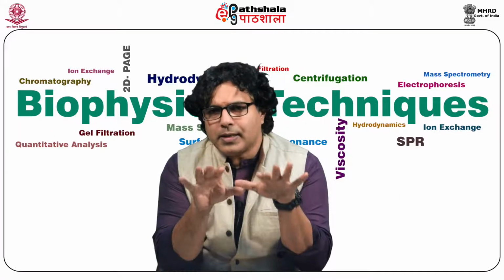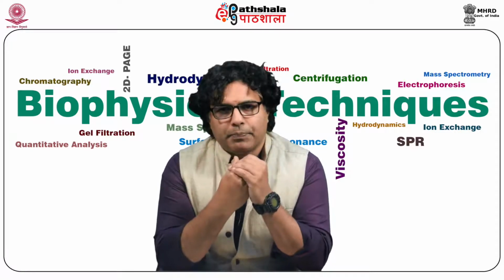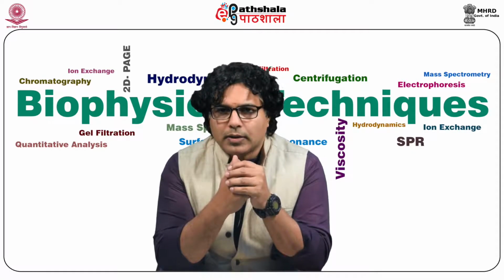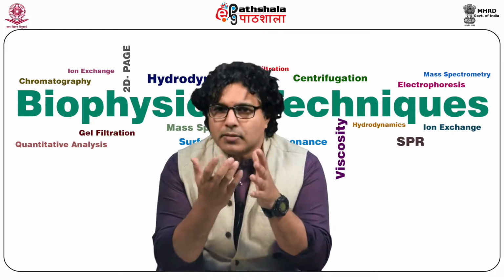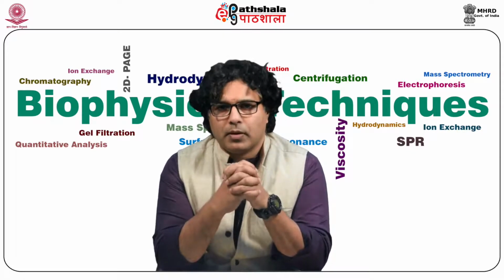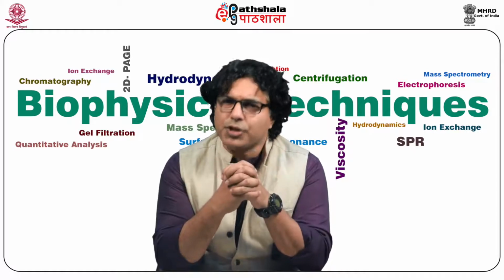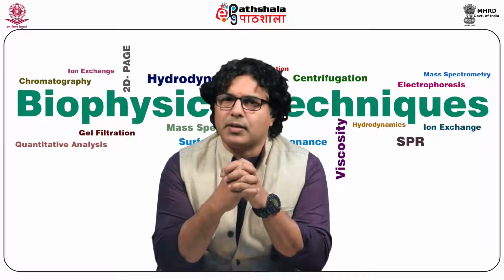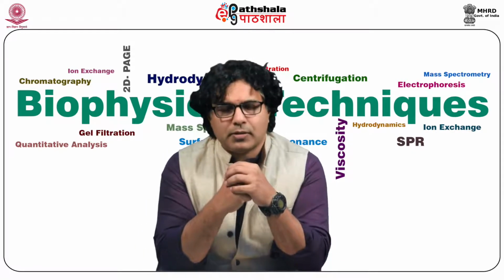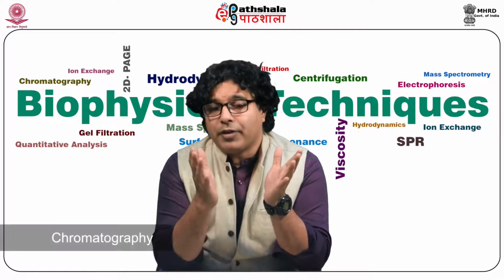Basically, HPLC is derived from the chromatography technique, high performance liquid chromatography. The performance has increased from simple liquid chromatography. I hope you remember that a Russian botanist, Tswett, first demonstrated the separation of carotenoids in a column, thereby the name chromatography was derived.